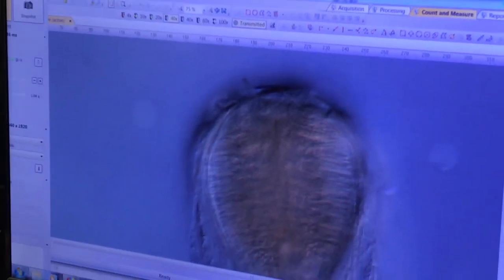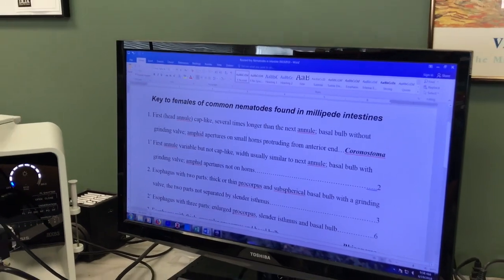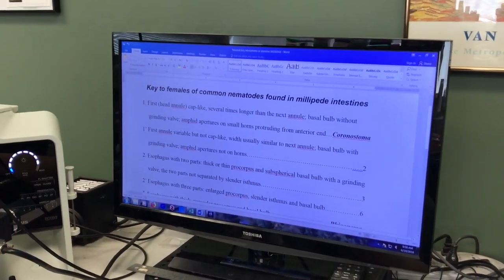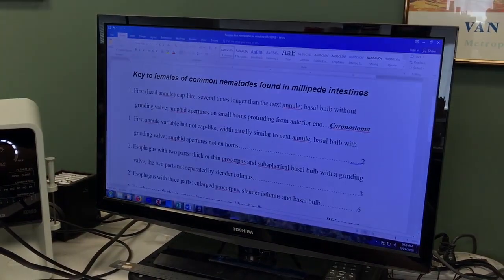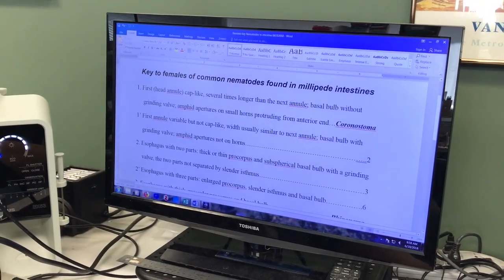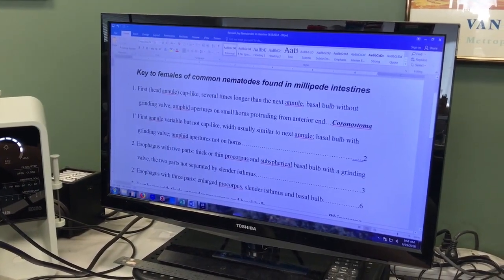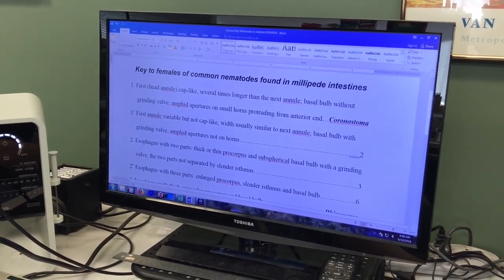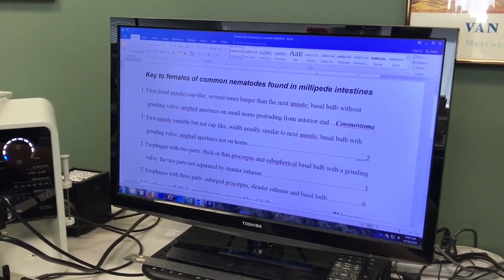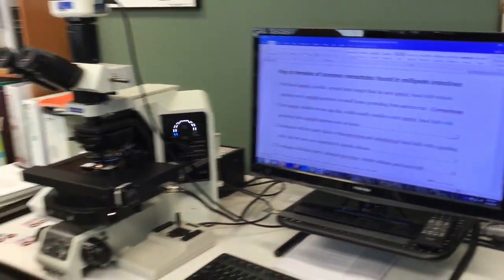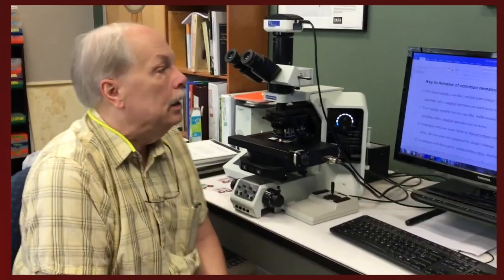So when we look at the alternatives in the key: the first annule is cap-like, much longer than the next annule; the basal bulb is without a grinding valve; and the amphid apertures — those are the sense organs — are on small horns protruding from the anterior end. So we know this is a member of the genus Coronostoma. It's nice when it comes out at the very first couplet because then we don't have to do any more. Fortunately this nematode is very distinctive and easy to recognize from those characteristics.